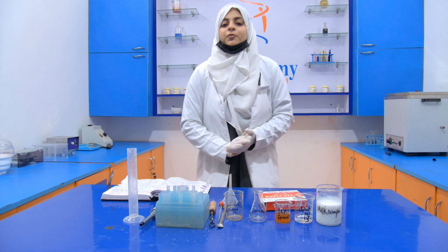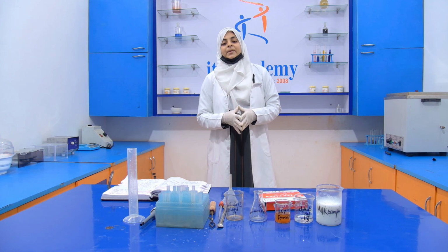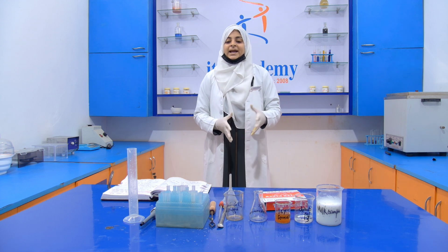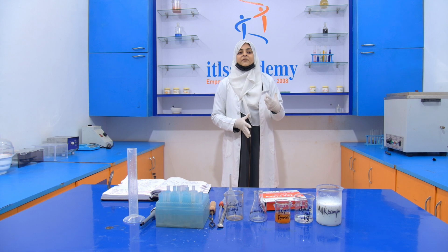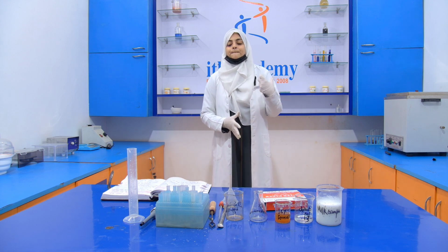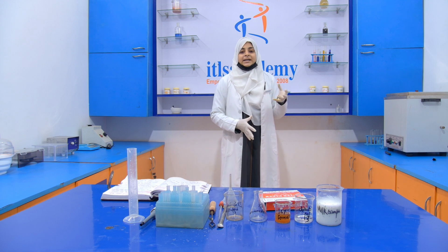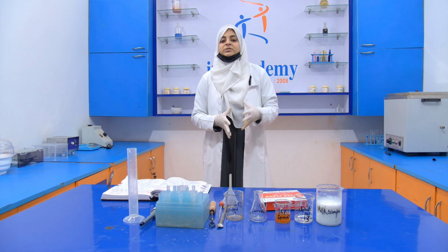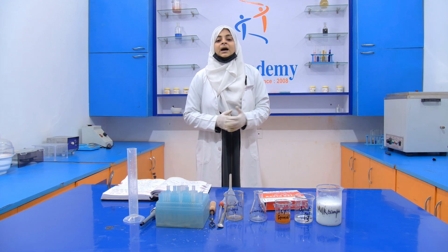Now what we have to do, we take 20 ml of the sample, and to the 20 ml of sample we add 2 ml of this dilute HCl. This dilute HCl is added to the milk for the acidification of the milk. Now we continuously mix it until curd is formed. After that, we filter it using a filter paper, and then we collect the filtrate.